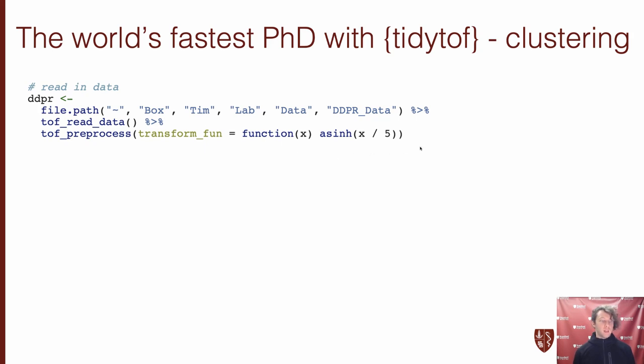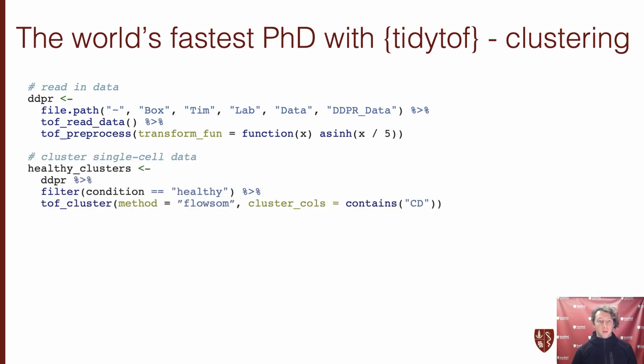Here, I've actually written out explicitly the default, which is the arc sinh transformation, a well-characterized variance stabilizing transformation in the CyTOF community. Next, we can actually perform the first step of the DEEPER algorithm by identifying the main types of healthy bone marrow cells that we have in our healthy cohort. So I do that here first by piping in our pre-processed tibble from the previous step into the dplyr function to filter just the healthy cells. And then from there we can pipe that into the TOF cluster verb, which applies the FlowSOM clustering algorithm to all of the healthy cells. And that's just one of five clustering algorithms that have their native support in TidyTOF.